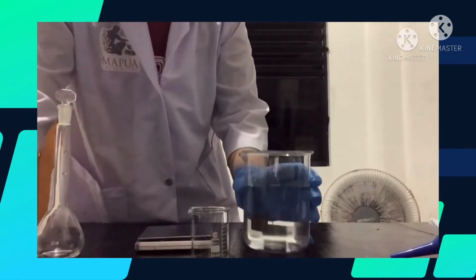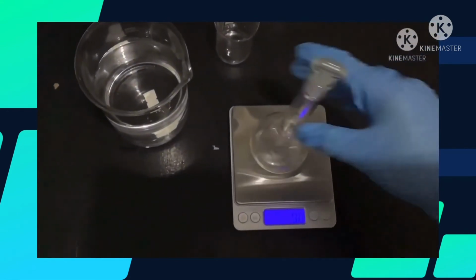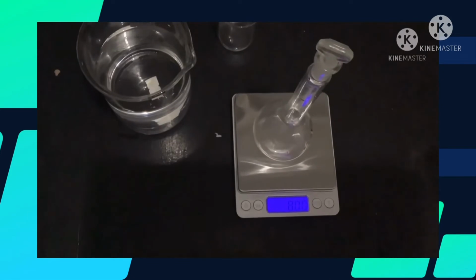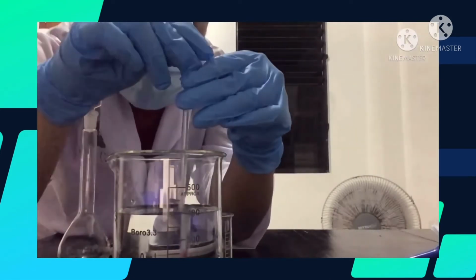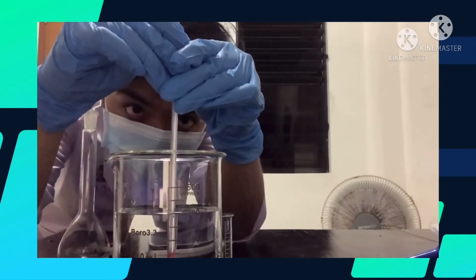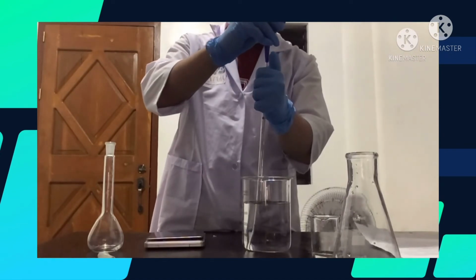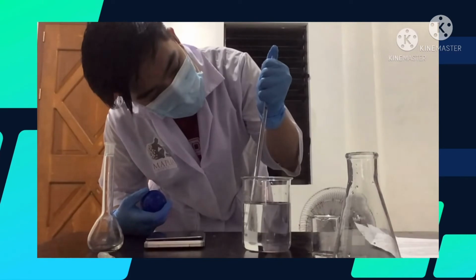Obtain a 400 ml beaker of distilled water equilibrated to room temperature. Determine the mass of the flask and the stopper. Next is to measure and record the temperature of the water. Pipette 5 ml of distilled water to the flask. Stopper the flask, record the mass of the flask and the water, and determine the mass of the 5 ml of water.